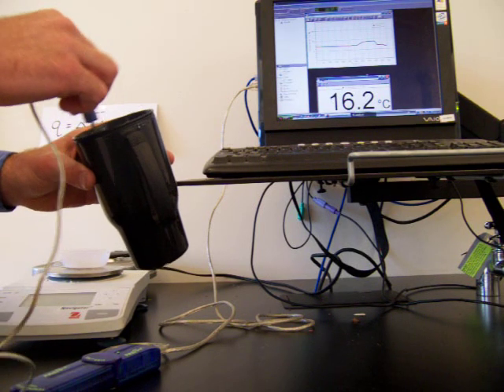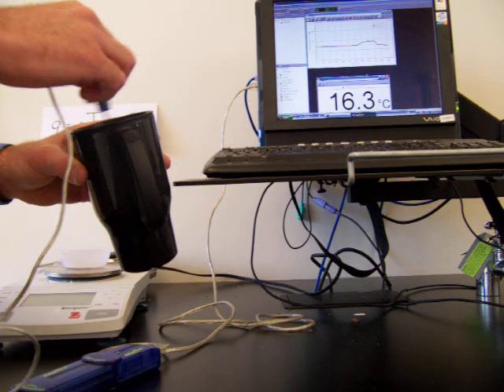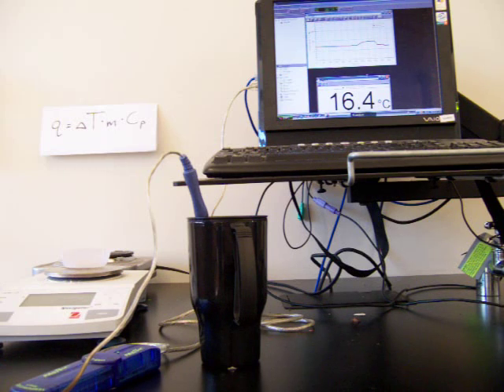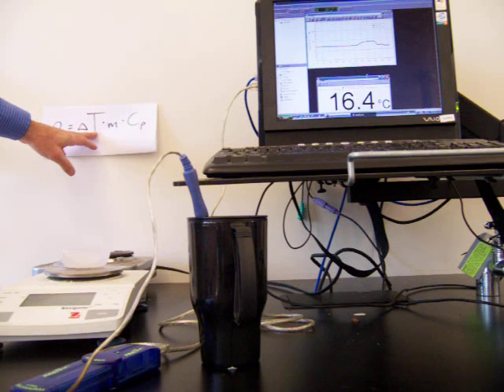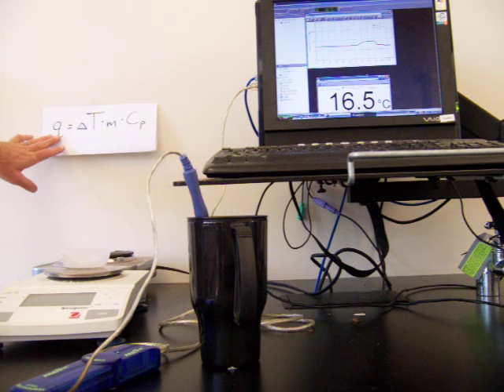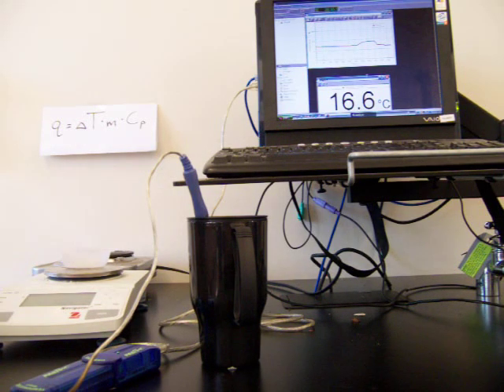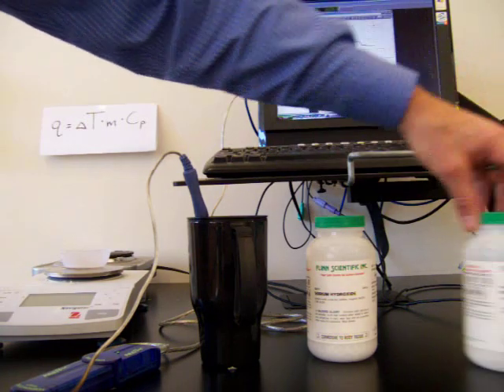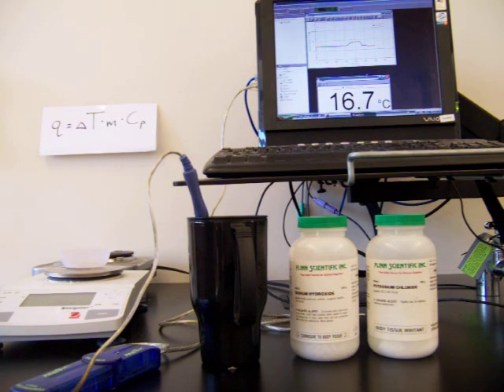We'll stir until the potassium chloride completely dissolves and we get the final temperature of the water. It's completely dissolved and the final temperature is 16.3 degrees Celsius — that's the coldest temperature the water reached. This time the temperature change is negative because the temperature decreased. Using Q = ΔT × mass × specific heat with a negative temperature change, it means the reaction was absorbing heat, so delta H of the reaction is a positive number. We now have all the information needed to calculate the heat of solution of sodium hydroxide, which was exothermic, and potassium chloride, which was endothermic — two salts dissolved in water, one released heat, one absorbed heat.